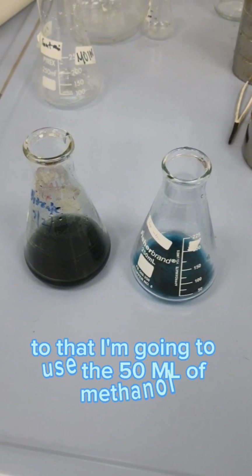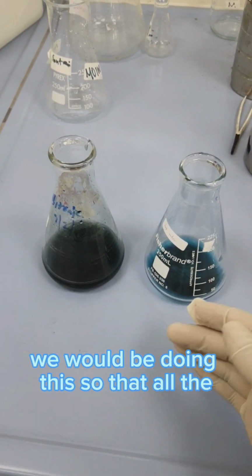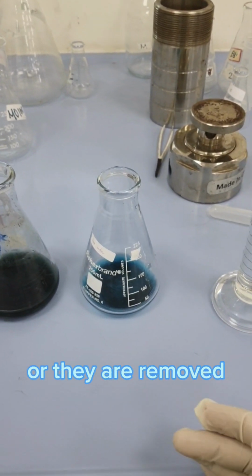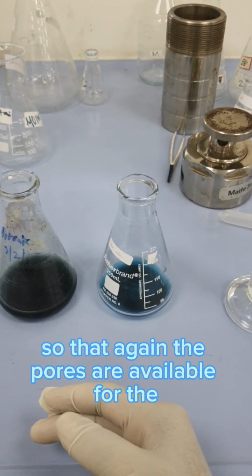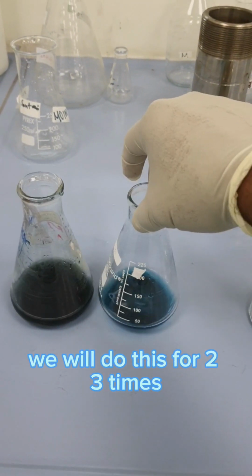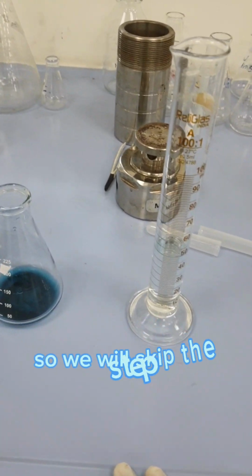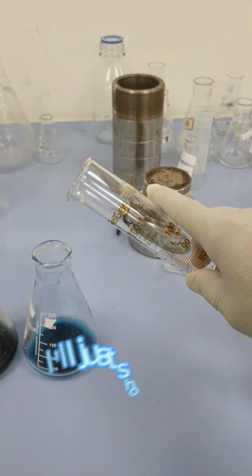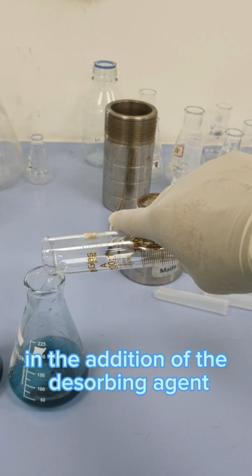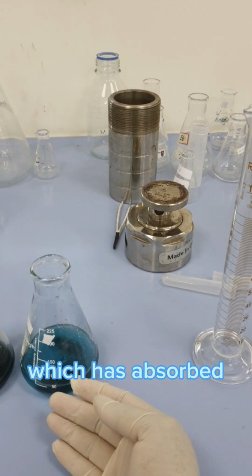To that I am going to add 50 ml of methanol. We will be doing this so that all the ions that have adsorbed on the adsorbent are dissolved or removed, so that again the pores are available for adsorption of the pollutant. Do this 2-3 times, and then we will also wash with deionized water. So we will skip this step. I'll just show you the addition of the desorbing agent. You can see when I added it, all the color which has adsorbed, the pollutant, is coming up.